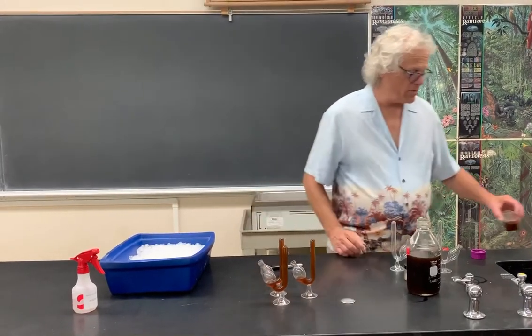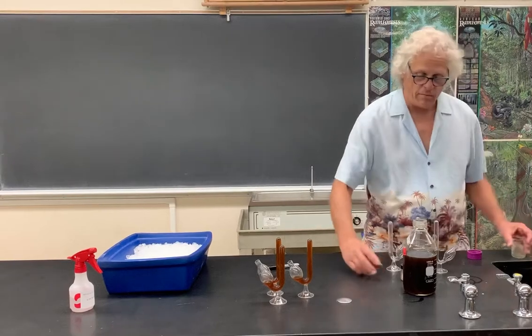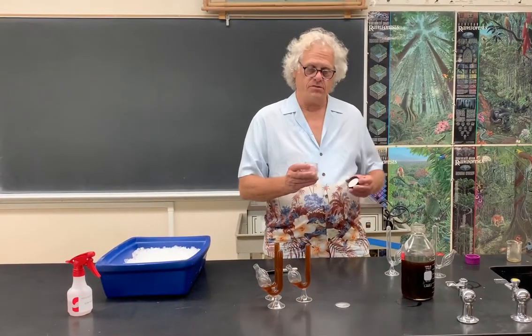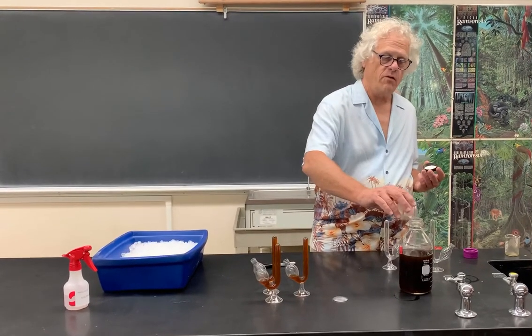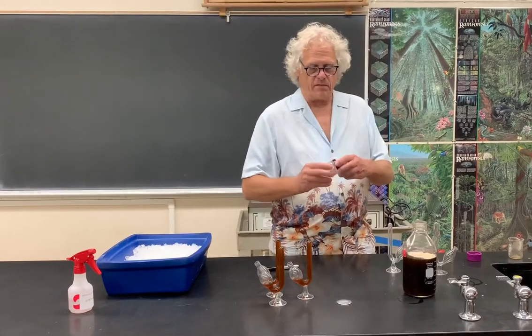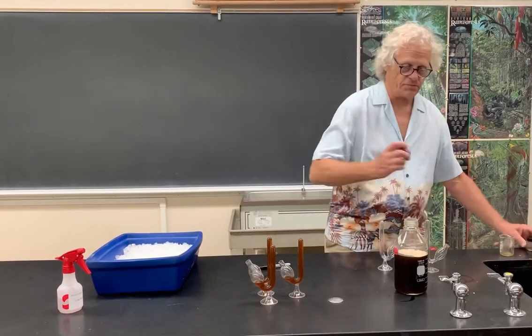In the experiment, we want to do the same experiment, but include yeast with the molasses. So I have a jar of yeast here. This is just like yeast you might use at home for making bread or pizza crust. Dump it in with that molasses and let it settle for a few minutes.